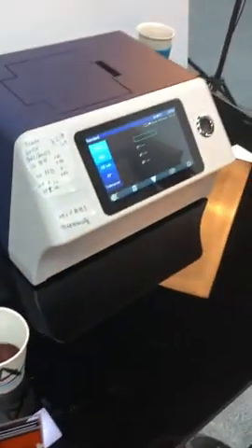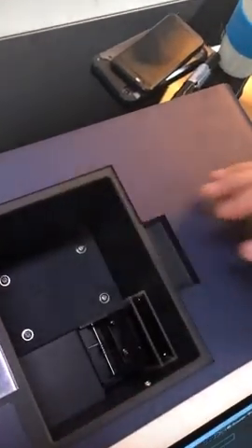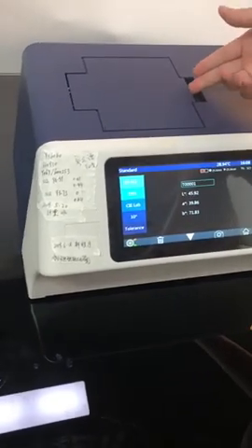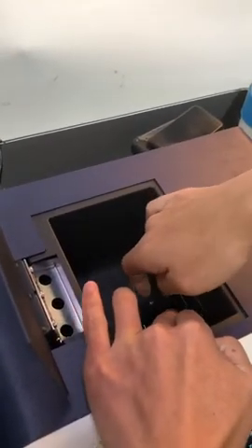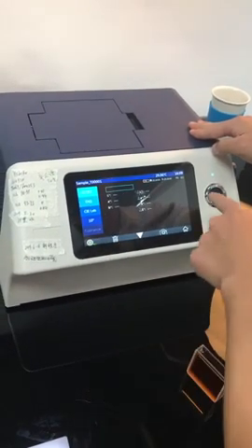It's ready to measure the samples. First, we put sample A in at the position and press the button to measure. Then we take sample A out and put sample B at the position. Go to the sample measurement interface.